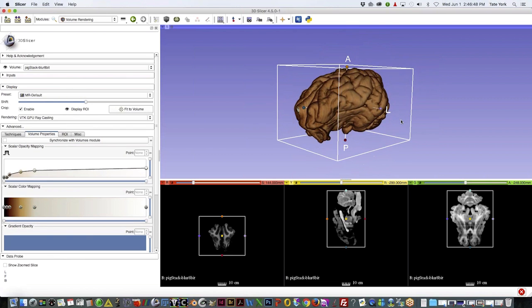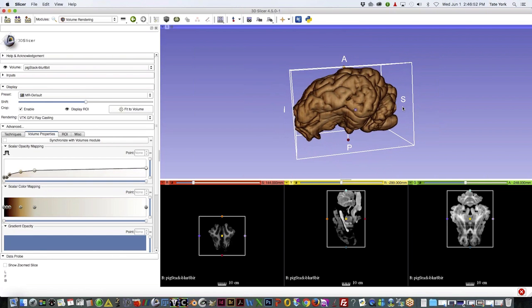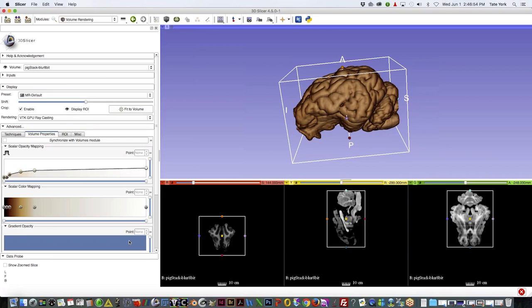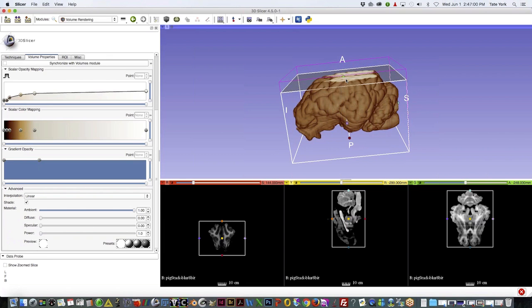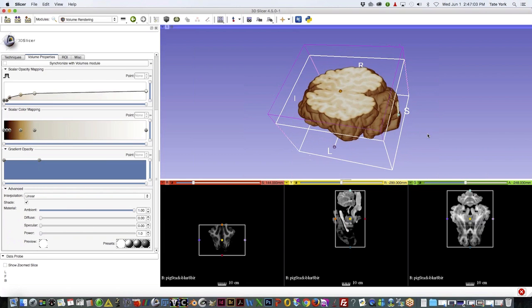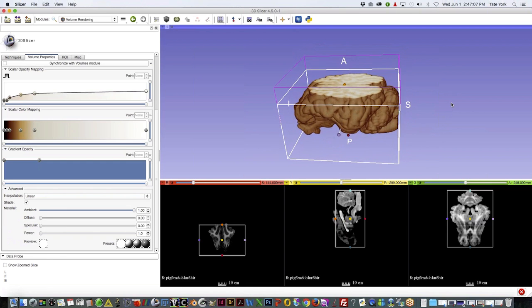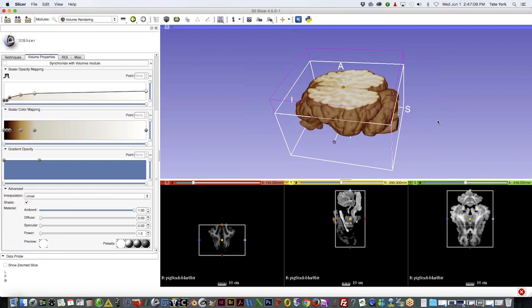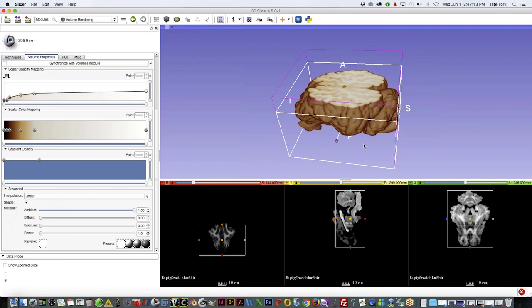Now I'm going to go into more of the surface map, and this offers a pretty interesting benefit, and this is also part of our website. We have a 3D reconstruction services page that we just recently added. So this is a surface map of that same pig brain.